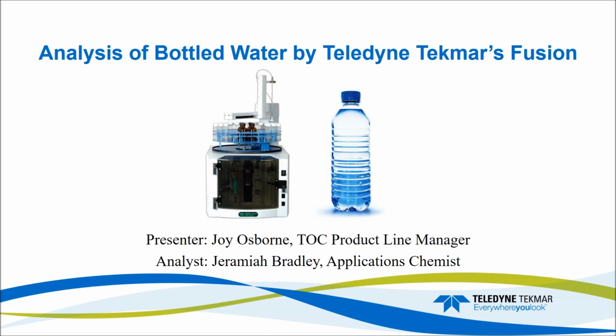To differentiate the various brands of bottled water, we disclose the source of the water, like if it came from a well or a spring, that kind of thing, and then its cleanup technique. Jeremiah Bradley was the application chemist on this study.